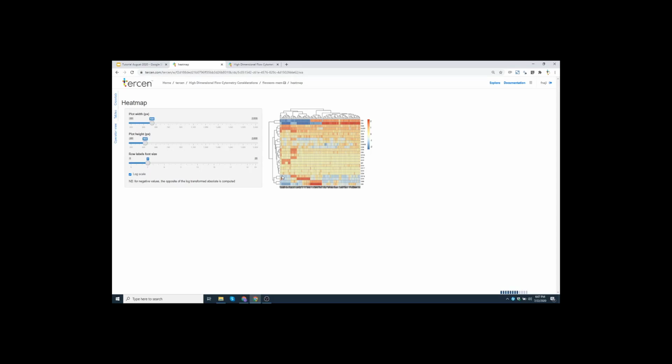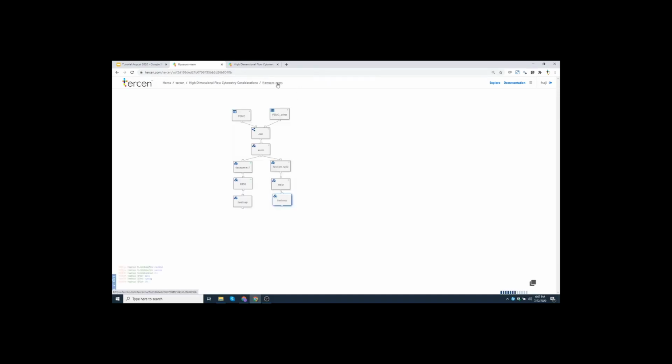and it also puts the markers that are similar together. You can see this block effect happening because there are quite a lot of MEM scores that are similar for many of the groups, and therefore we would have an over-clustering scenario. You can see this blockish effect happening here. If you count the blocks, 1, 2, 3, 4, 5, 6, 7, you see that 7 might be a better number of clusters to use than 90. So I did that. I did 7.